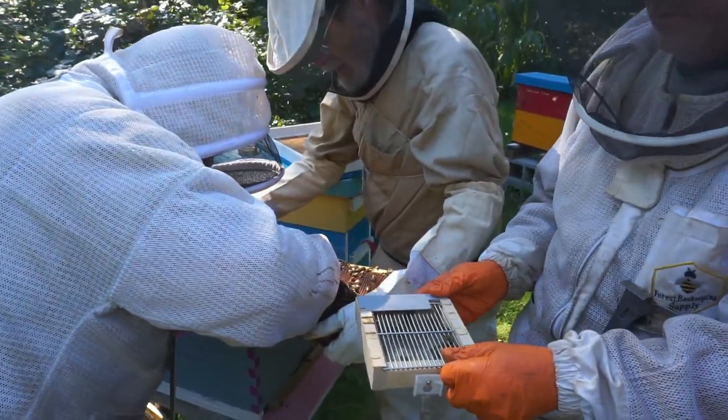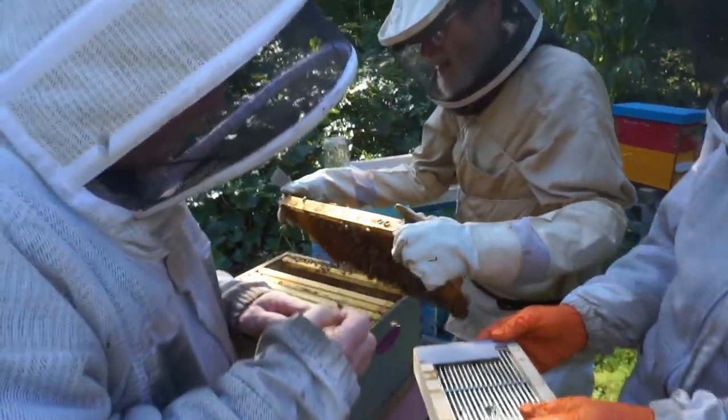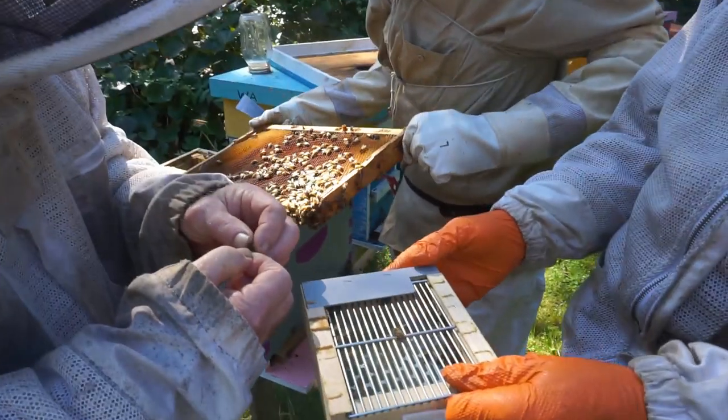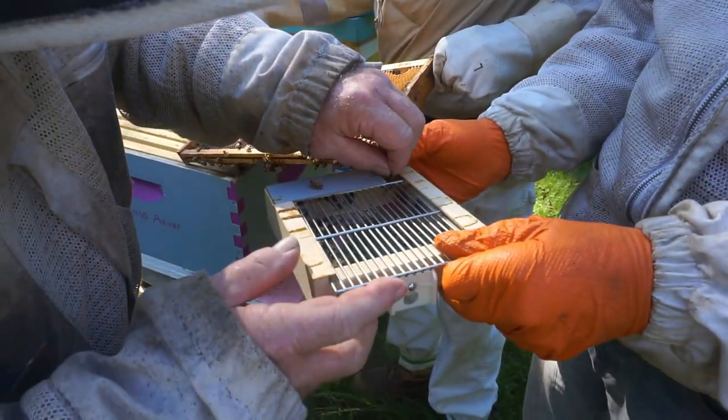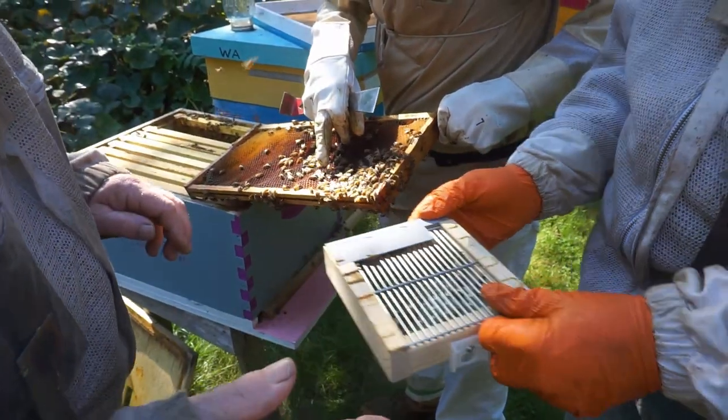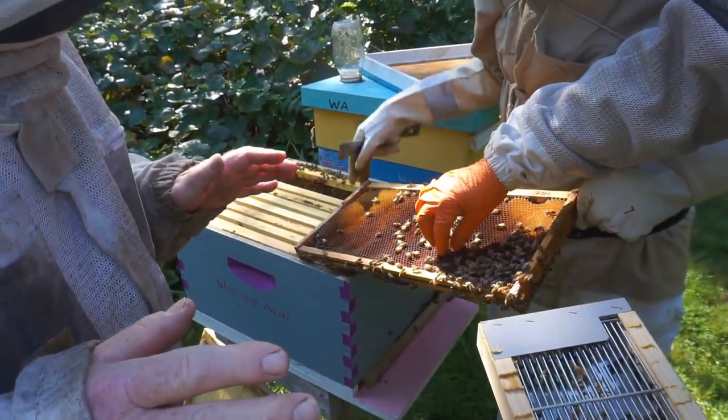So Bob, you want to explain what you're doing to the camera? Yeah, what we're doing here is we're going into our hives, identifying drones and putting them in this drone cage. You want the mature drones.